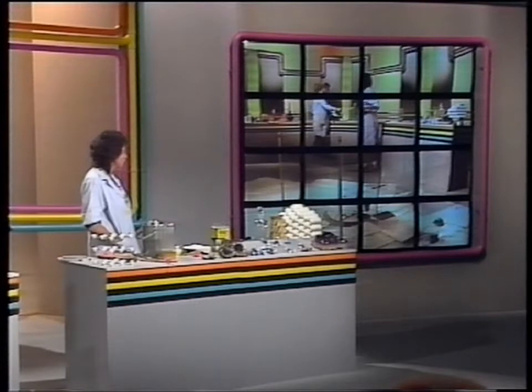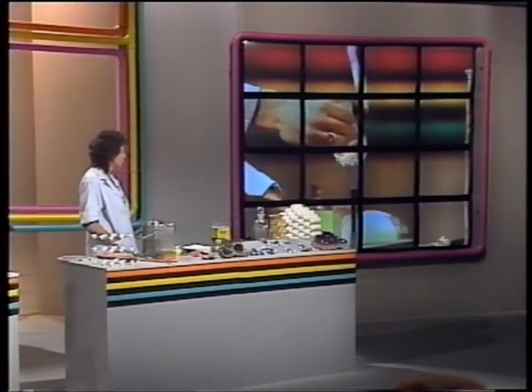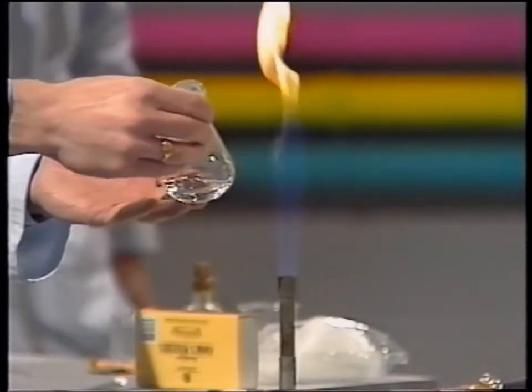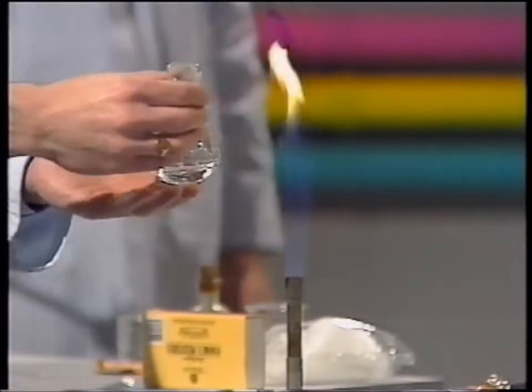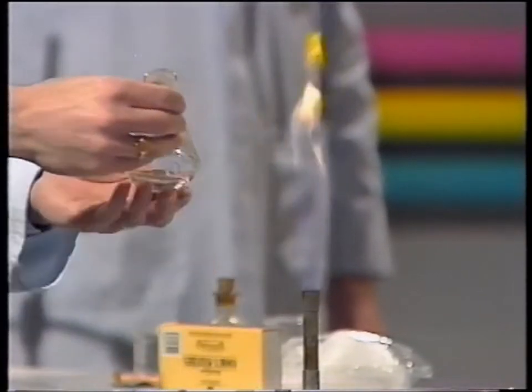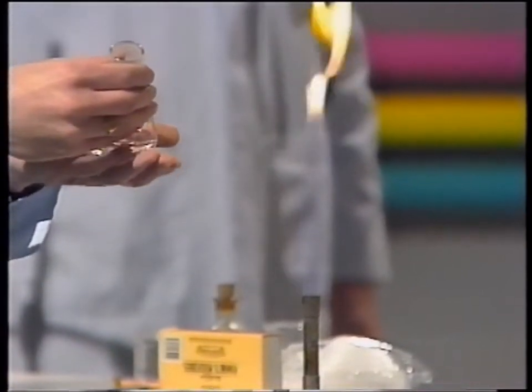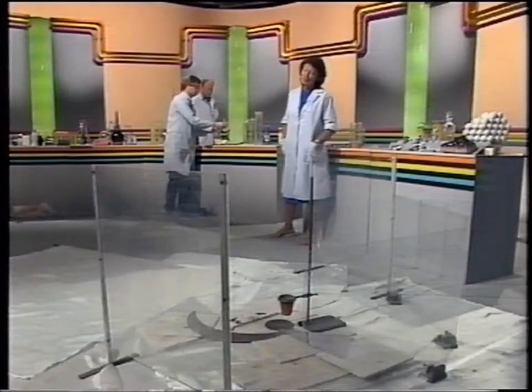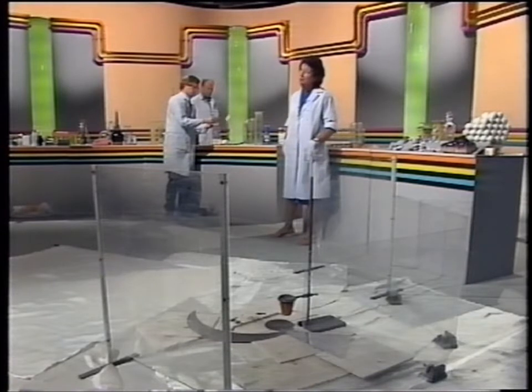Mike here is warming up some glycerol, and this will start the reaction like a fuse with the potassium permanganate oxidizing agent, and then within 20 or 30 seconds he's got to get out of the area because this violent reaction will occur, and we hope that we'll see molten iron at 1500 degrees C pouring out of the bottom of the flower pot.